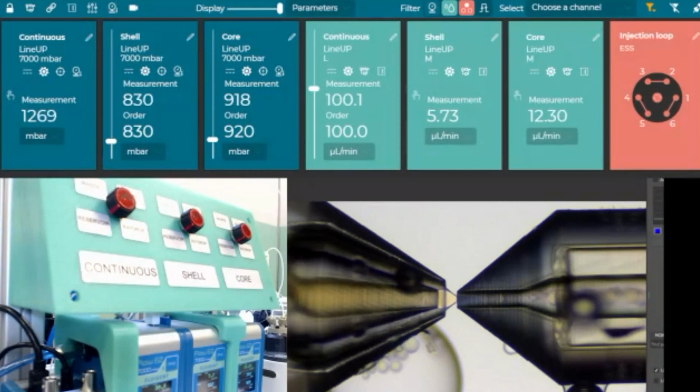In the video we showed you previously, there were no satellite droplets. So it depends on the fluids and on the fluidic regime. But in the FACS application setup, yes, you will always get this satellite. But as I said, that is not an issue for the FACS analysis.